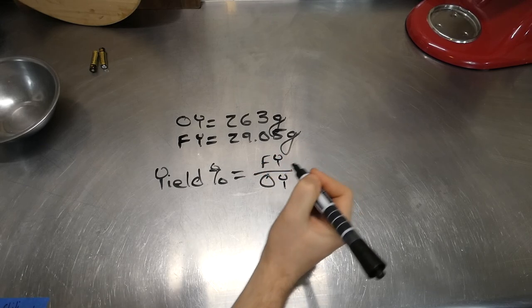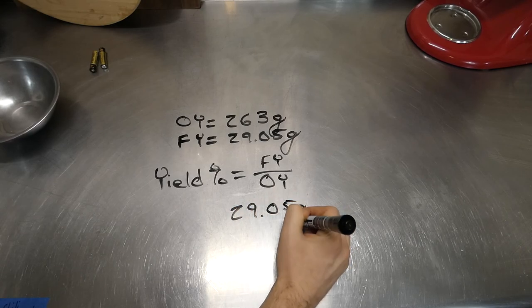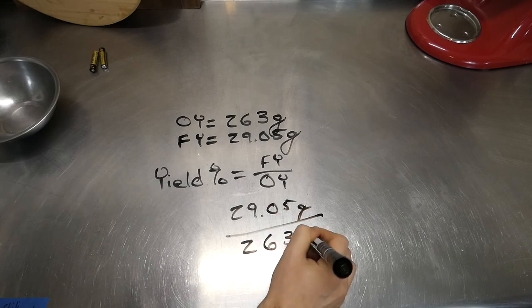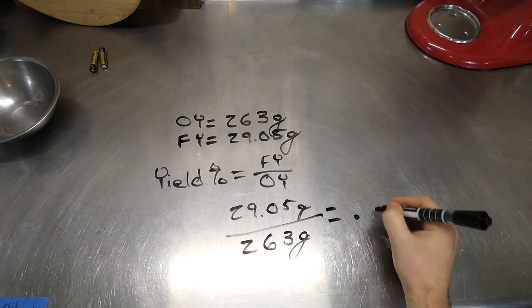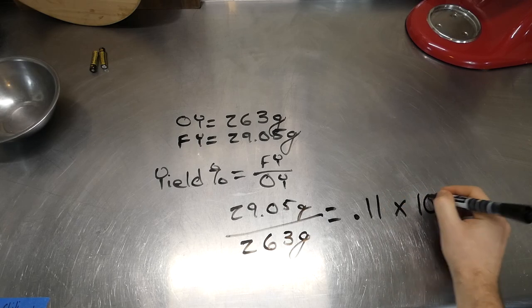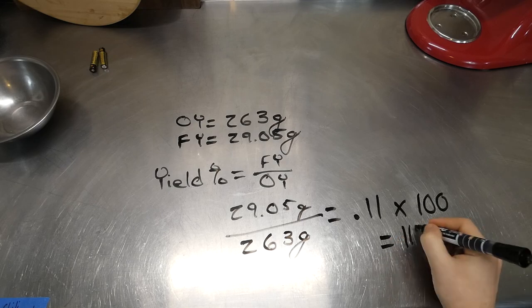So in order to calculate the yield percent, you're gonna take the final yield and divide that by the original yield. So it would be 29.05 grams divided by 263 grams, which will then equal 0.11. And then you're going to times that by 100 because we're getting a percentage. And that equals 11%.